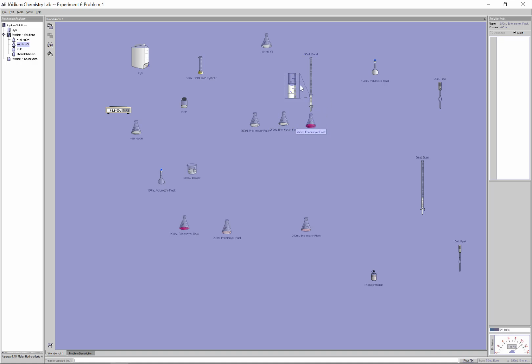This one here currently says maybe 39.25. If you just did a quick calculation there, we're actually using about 33 milliliters for this titration. Again, I definitely don't have another 33 in here. I only have another 10 mils or so. What I want to do is I want to reload this. So take my diluted NaOH here. Let's reload it to something more than half. So let's pour in, if I can, maybe 35.